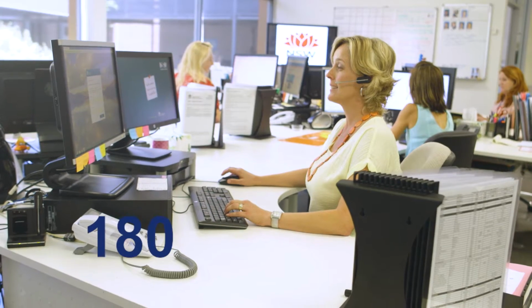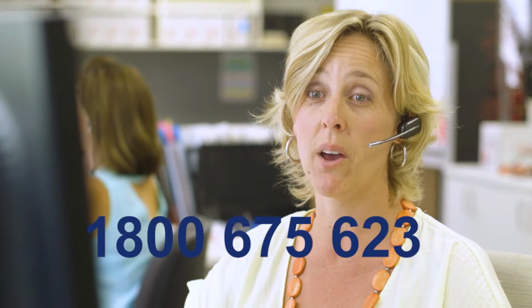Packing Category A samples is not a common practice. We strongly recommend submitters call our customer service team for advice on packaging and sending samples of this nature. Heavy fines apply for poorly packaged dangerous goods.